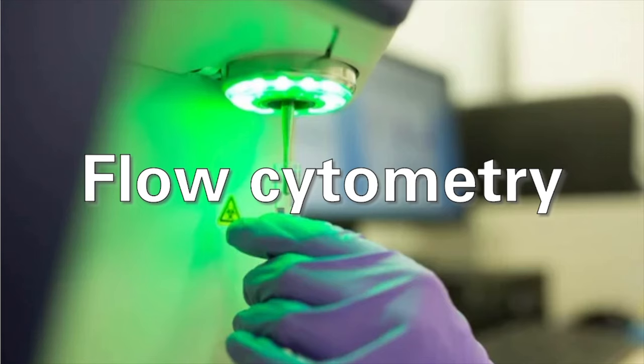In this video we're going to be looking at the technique of flow cytometry and FACS, which is fluorescent activated cell sorting. We will discuss the theory behind the technique and some of the applications in the laboratory or clinic.